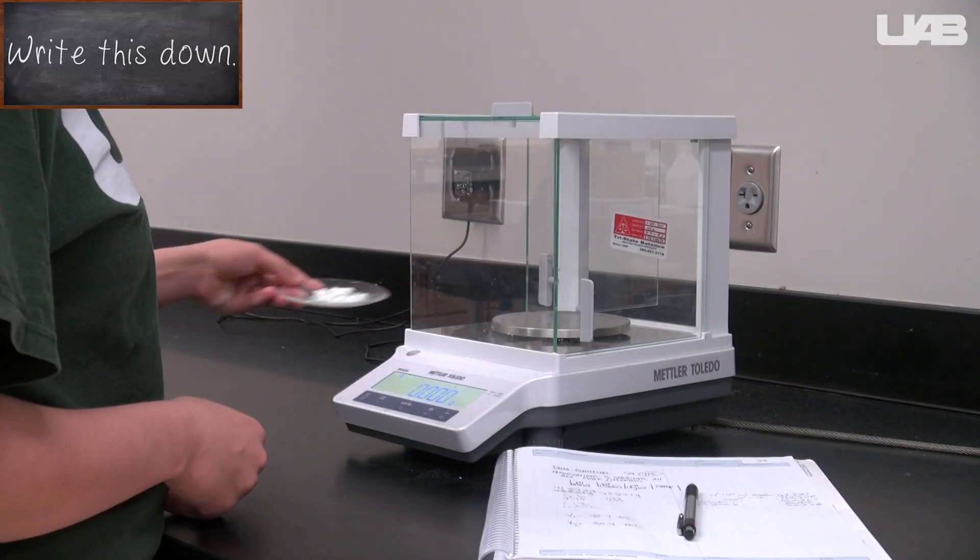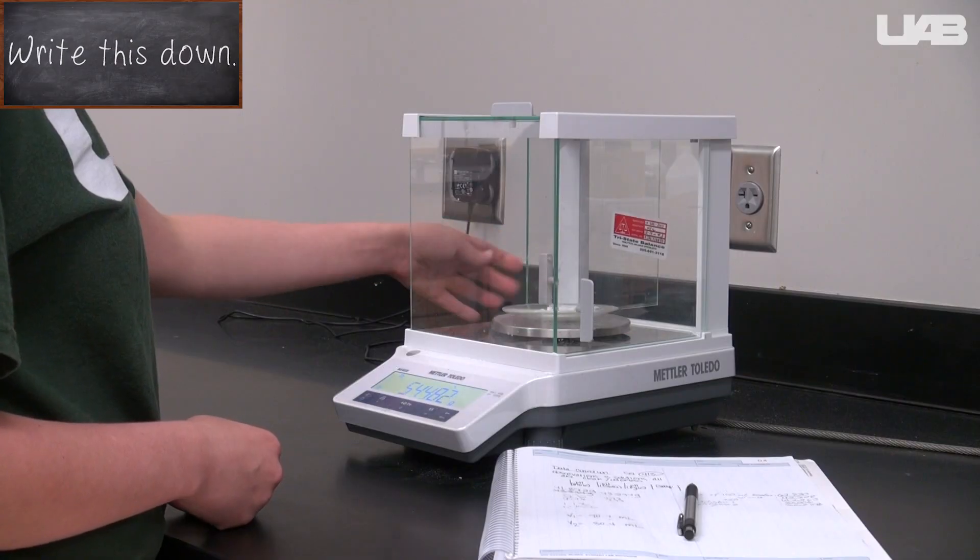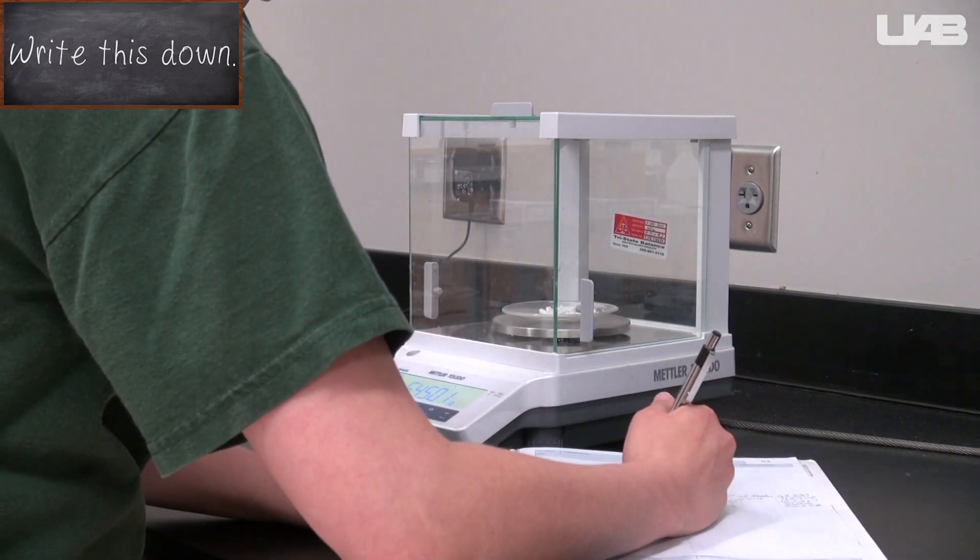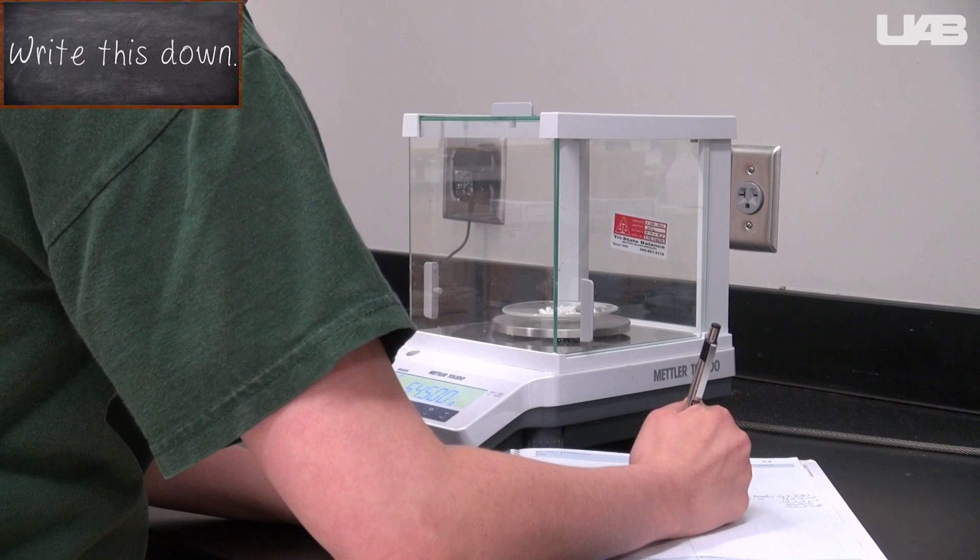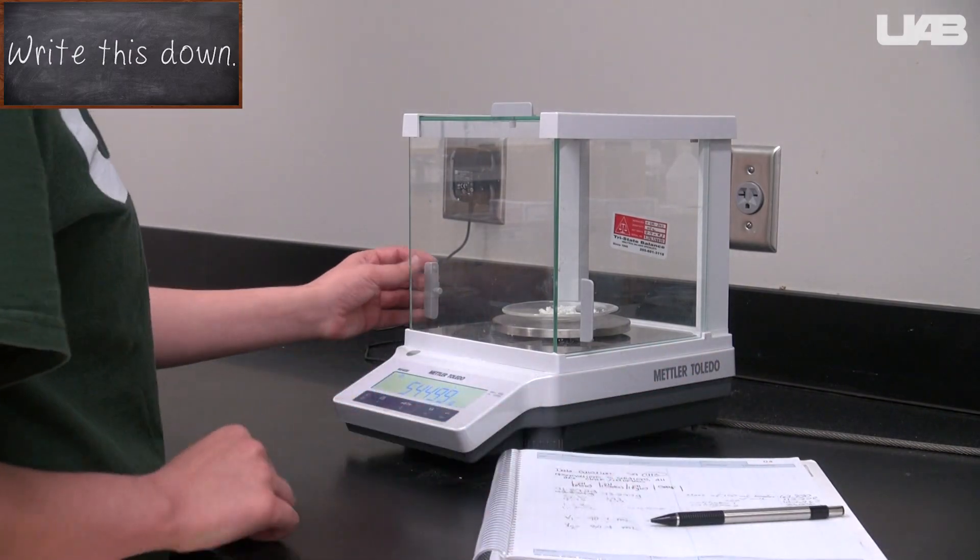Next week, before you start that lab, you should determine the mass of the beaker and the two watch glasses with the various components on them and then compare these masses to the ones that you measured while empty before starting last week.